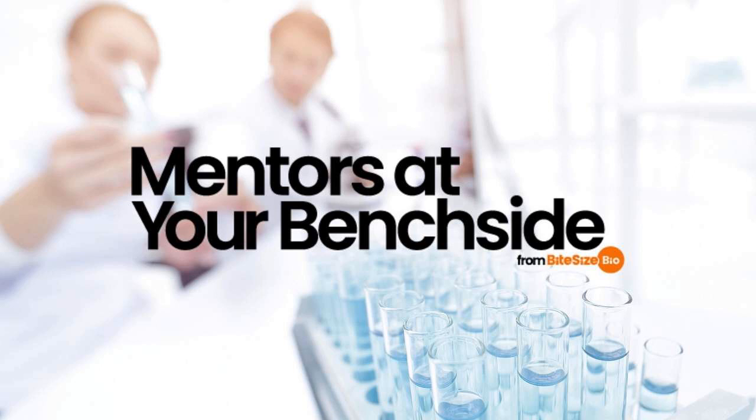Therefore, Maxam Gilbert sequencing and the Sanger method comprise the first generation of DNA sequencing methods. However, while Sanger sequencing is still widespread, Maxam Gilbert sequencing has been largely forgotten. You might be surprised to know, therefore, that when both methods were discovered, Maxam Gilbert was the more popular one. This popularity was because scientists could use purified DNA directly, while the initial Sanger method required DNA cloning for the start of each read. Listeners will appreciate that cloning can be problematic today, let alone several decades ago when the idea and underlying technology were still new.